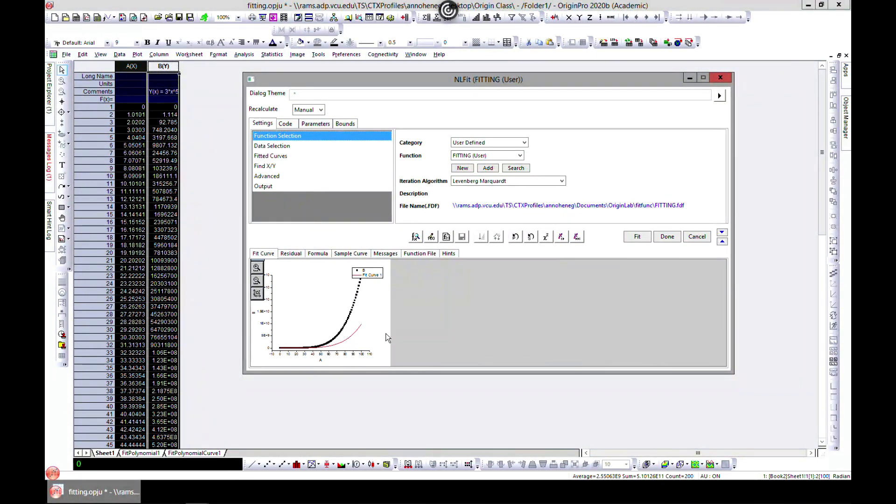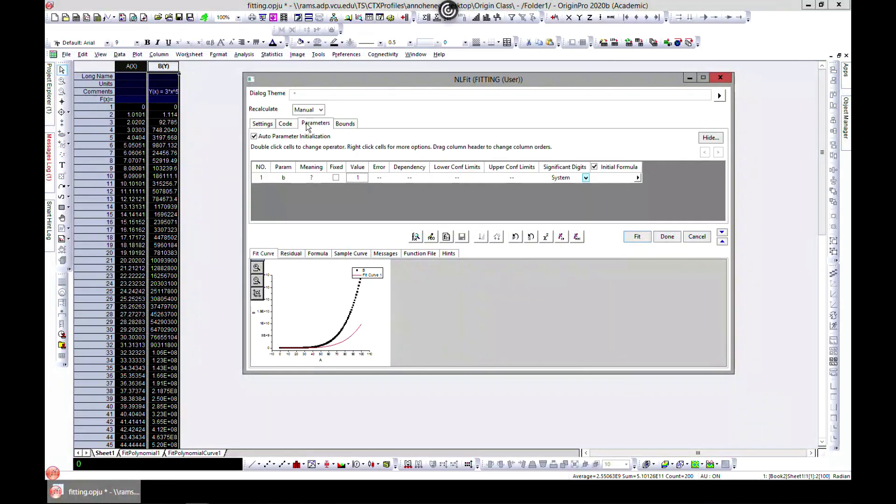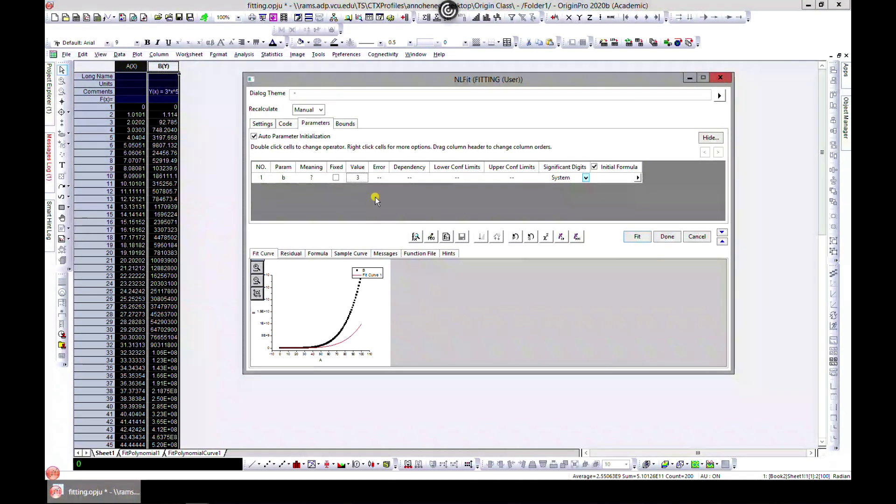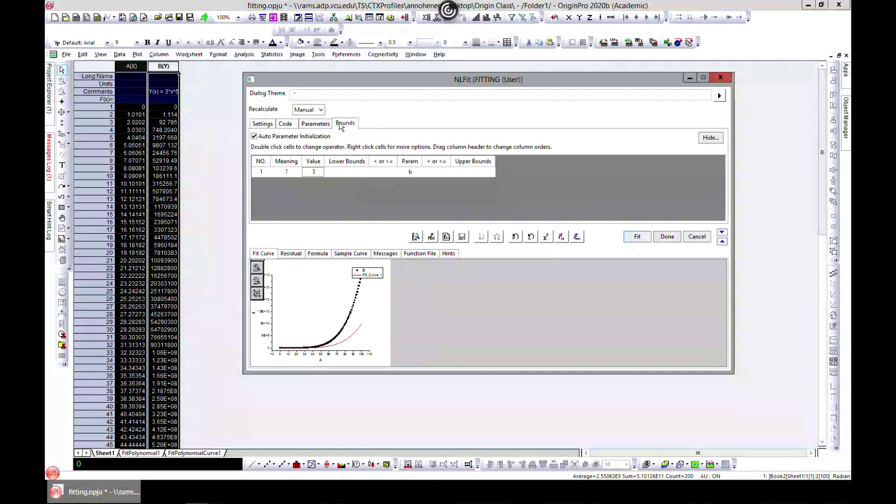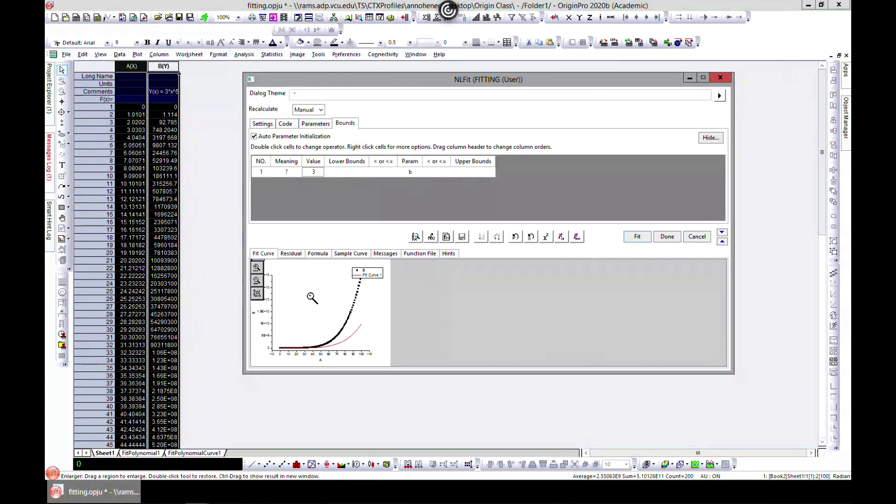You can play around with the code and also see the parameters you used and adjust them as well. This is quite a cool tool to use. You can see what you will get or have a preview. You can zoom in and see the results.